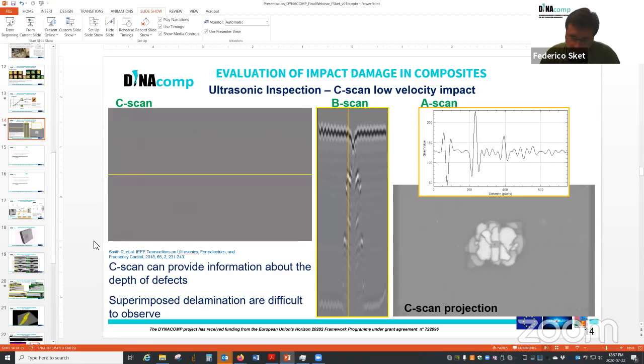Okay, well, I see some complications with that. The best I could take a look at is infrared thermography, because infrared thermography uses temperature by default, heating the sample. When you heat the sample, and if the material self-heals, I can imagine it will change the microstructure, and it will probably give you a different picture of what is going on.